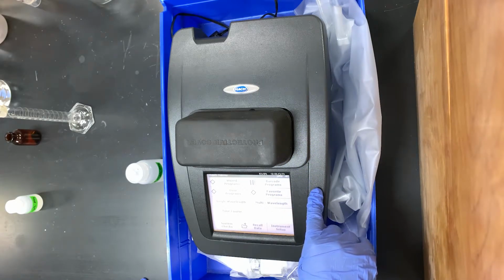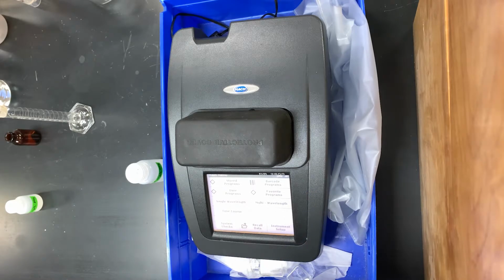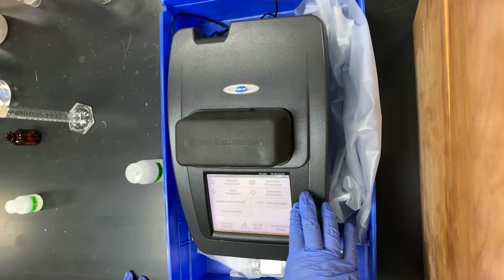So this spectrometer is from the company Hach, and while they can measure absorbances for standard curves, they can also just directly measure the concentration of compounds. So to do this for phosphate, I'll be using something called the powder pillow ascorbic acid method for phosphate analysis.